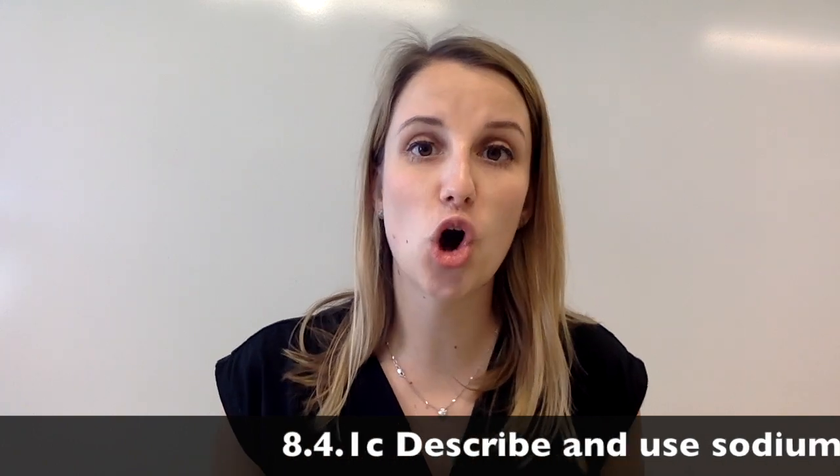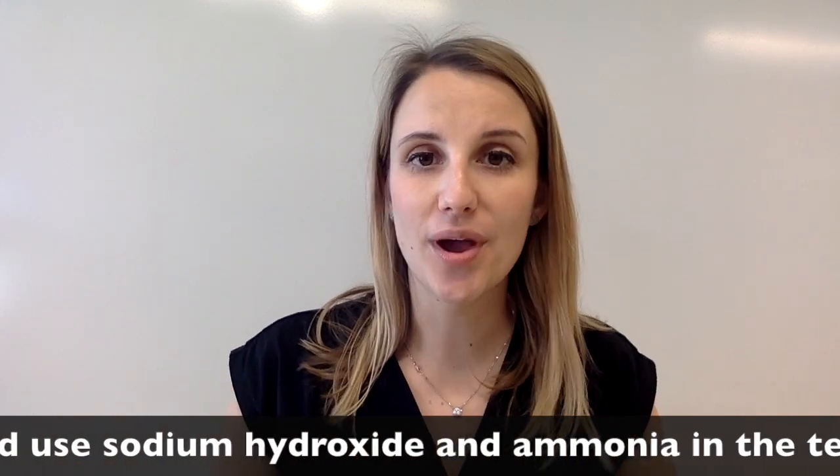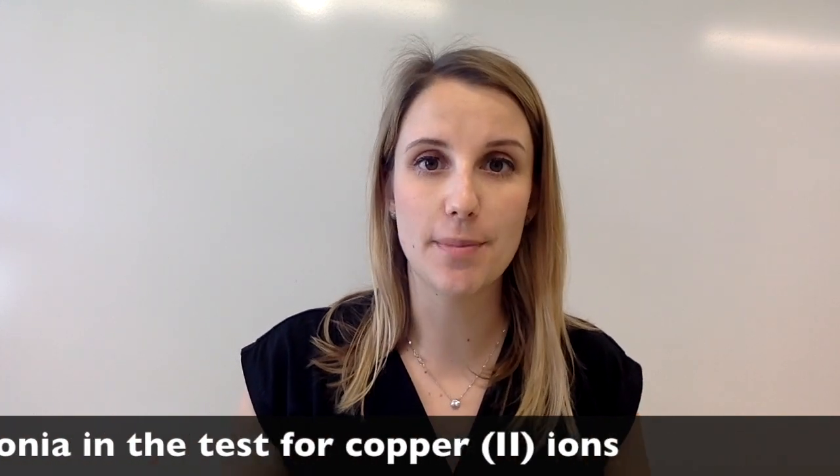Let's check out the test for copper two plus ions with ammonia and with sodium hydroxide. We're going to look at the experiment first today and then we're going to look at the equations that cause those reactions to happen.